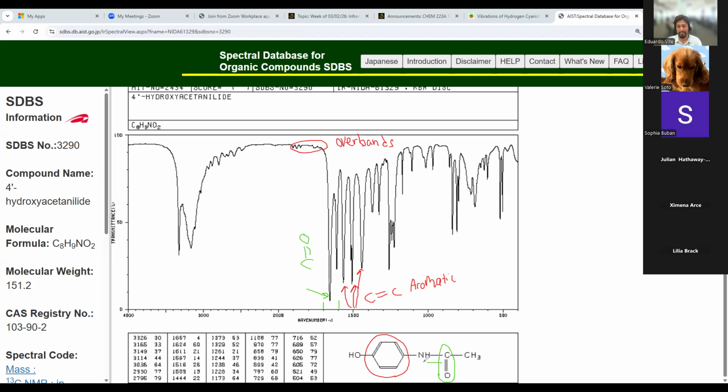And you'll see that we have NHC double bond O. This is an amide group, right? The whole group is called amide, but this specific part in the pink right here, that is your amine stretch. And that is most likely this peak right here. This one right here is most likely your nitrogen-hydrogen stretch. And since you only have one nitrogen-hydrogen bond, you should only see one nitrogen-hydrogen peak.